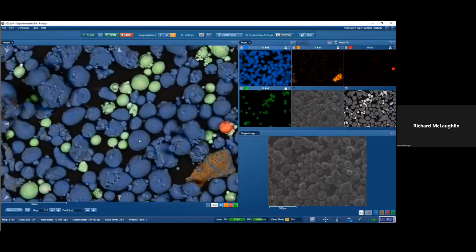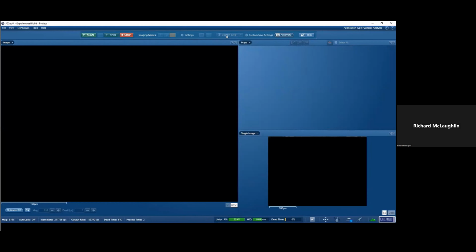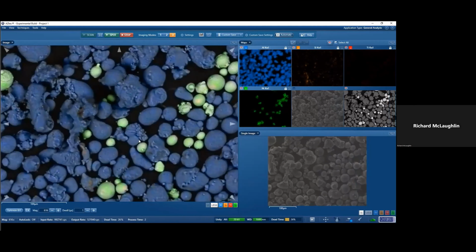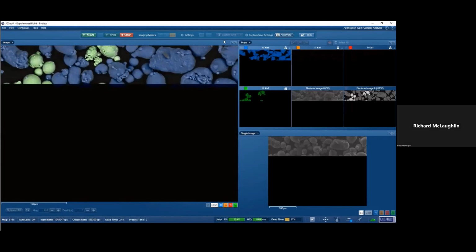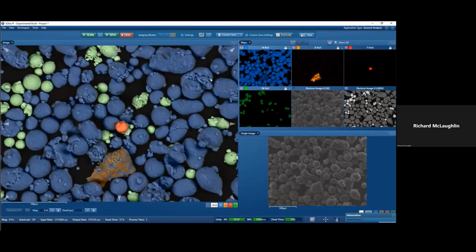So just to give you an idea of its performance. This is a special BEX navigator, but if you're familiar with live chemical imaging in the regular part of Aztec, it's very similar, with some improvements. With this, you can see that we're getting all the information possible from our sample, and we can find areas of interest for further analysis. Once we've found an area, we press the capture button, and then we have a permanent map, a permanent acquisition, and that's automatically stored in the project.